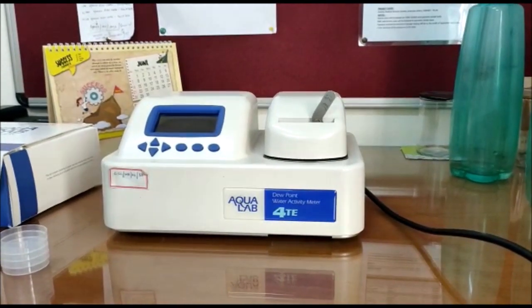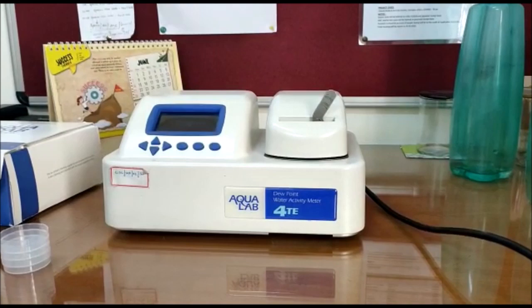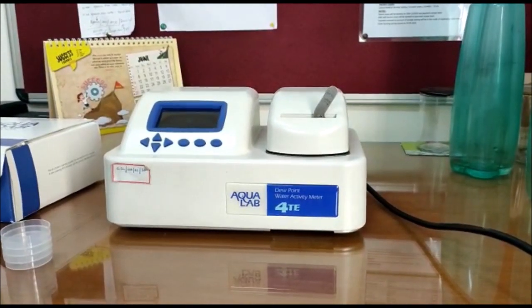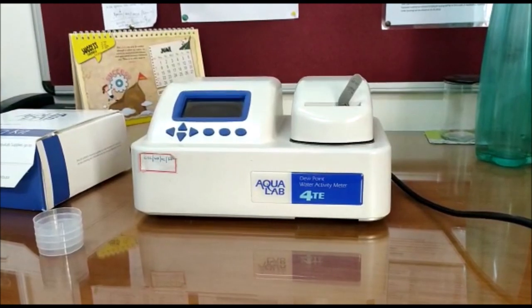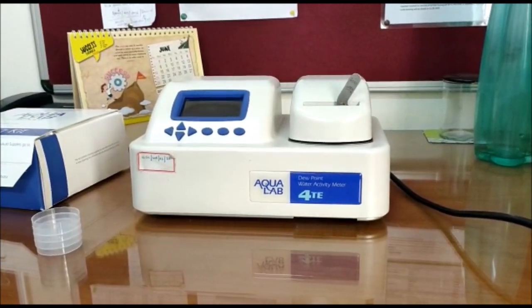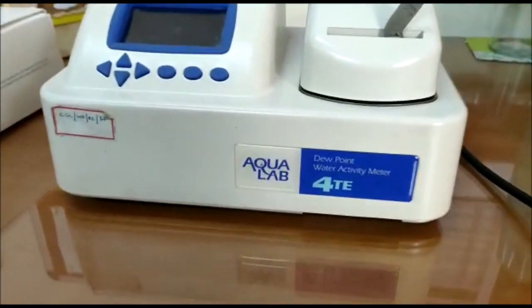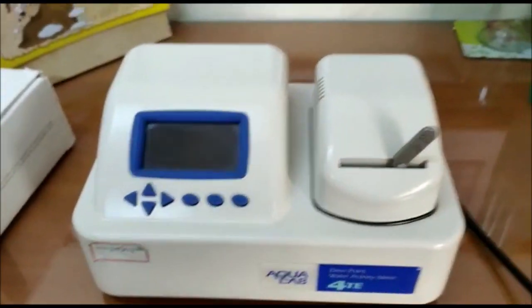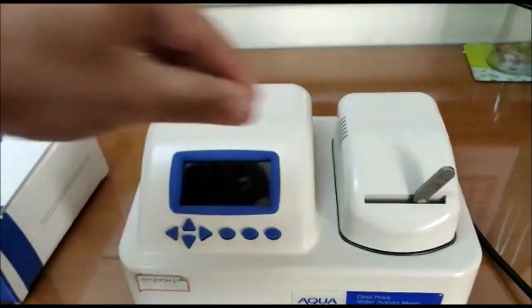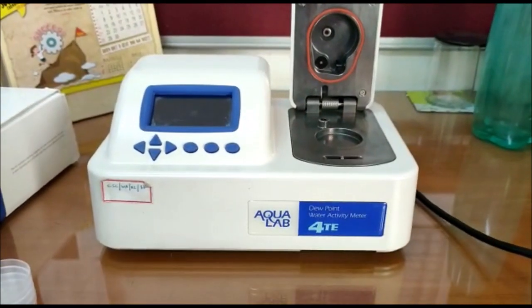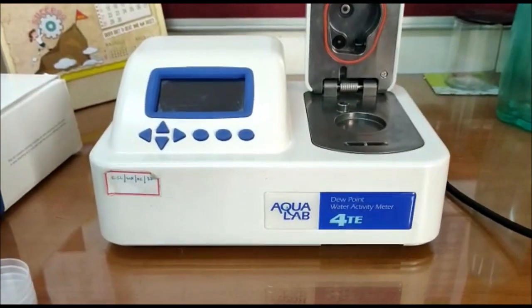This is the most popular and widely accepted instrument in the field of water activity meter across the globe. Let me show you what comes in the package of Aqualab water activity meter and how it looks like. This is a benchtop instrument, lightweight and small in dimension, but very technically equipped.